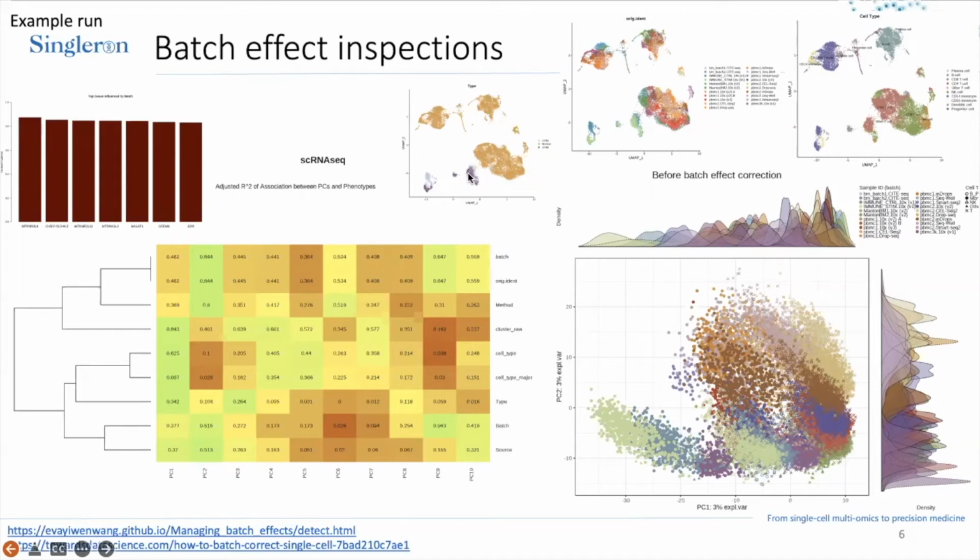Later, one of the ways to check whether the batch correction algorithm is overcorrecting is to go back to the UMAP, for example, to check whether any diseased sample is left. The cells are grouped slightly differently from the normal samples because we may be expecting some biological or treatment differences within the sample metadata on top of the sample level batch effects. So initially, looking at this UMAP itself, we observe quite serious batch effects.